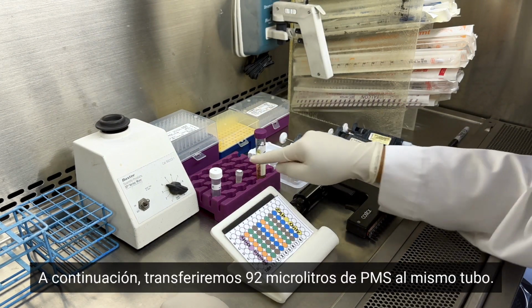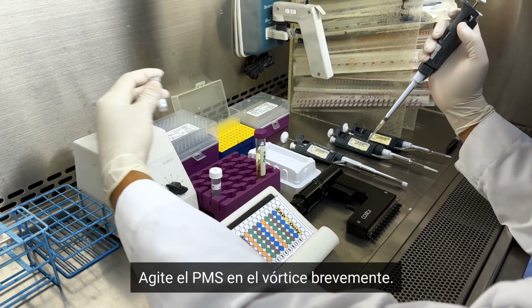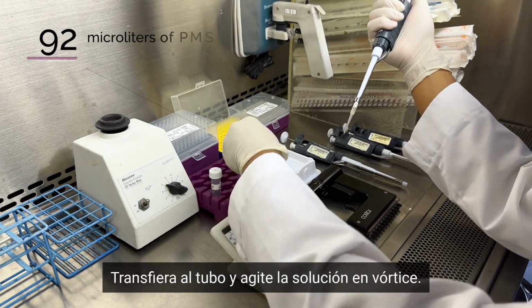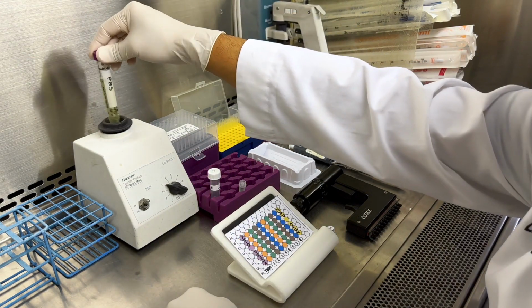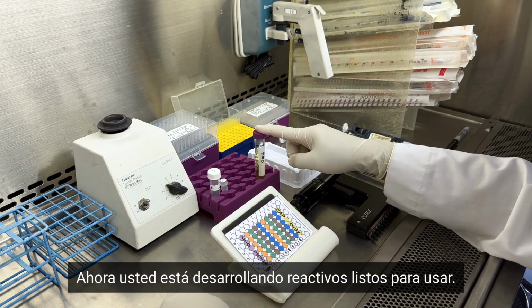Next, we will transfer 92 microliters of PMS into the same tube. Vortex the PMS briefly, and transfer the tube and vortex the solution. Now your developing reagents are ready to use.